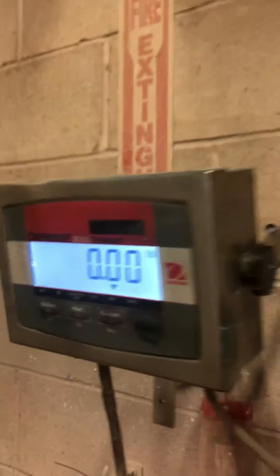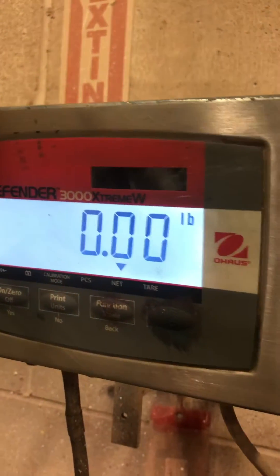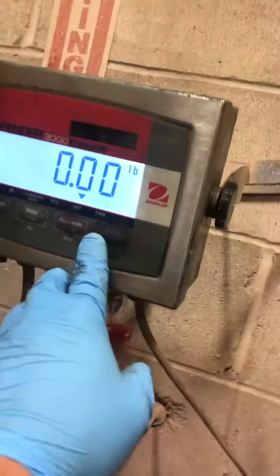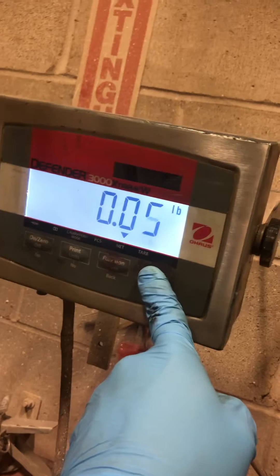How to adjust the calibration of an old house Defender 3000 or T32XW. This is the menu key — obviously it's covered, but this is the menu key. You hold the menu key down.